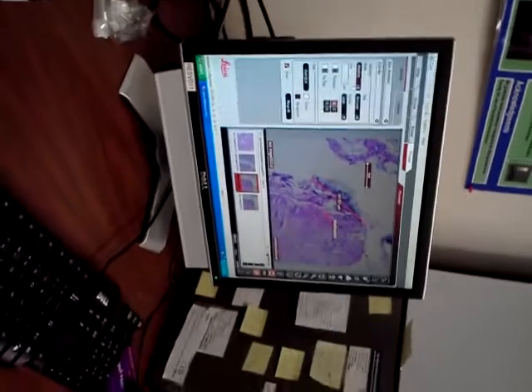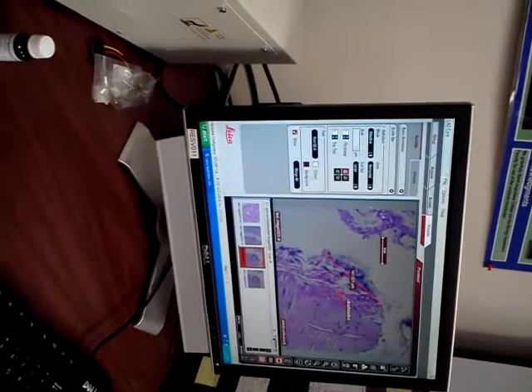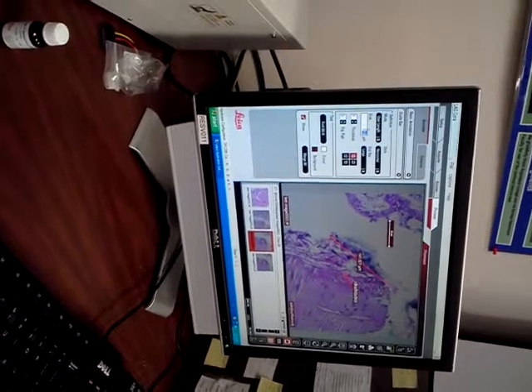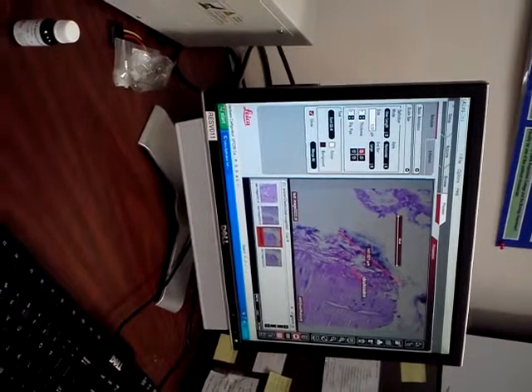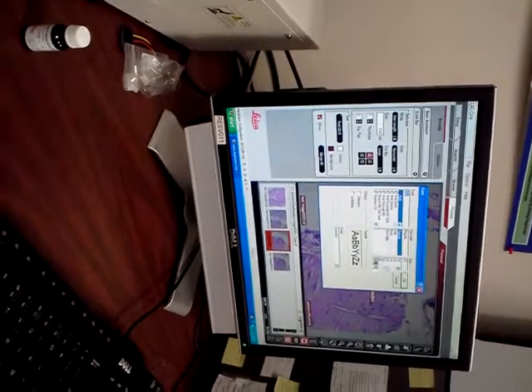And it's adaptive, so it's going to fit the objective that I used. So it's not going to give you a really, really long one. But you can change the font, you can change the size, and the length if you wanted to. You can go to 100 microns if you want. And you can change the font size.